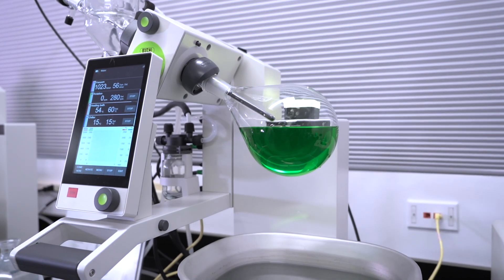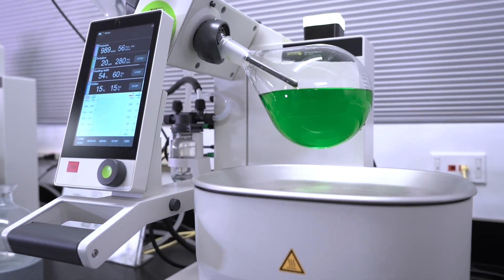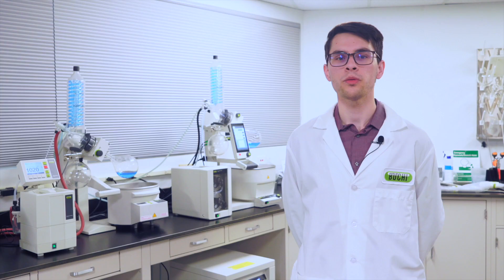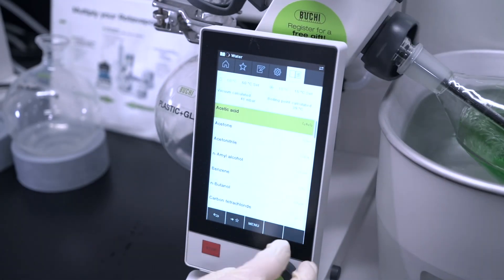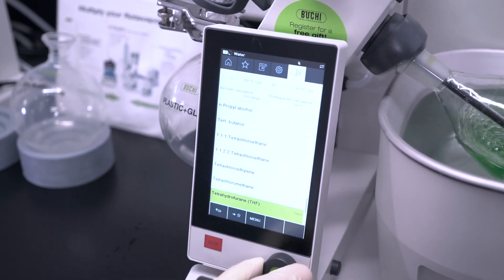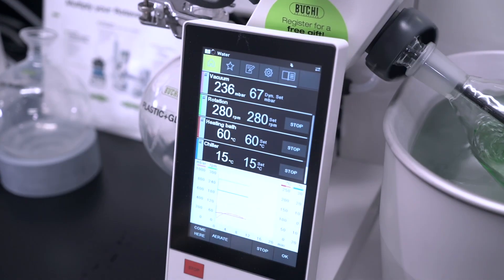The R300 pairs perfectly with the I300 or I300 Pro interface, bringing all process parameters to one central controller. When connected to an I300, simply pushing start once will heat up the bath, cool the chiller, pull vacuum, and rotate and lower the evaporating flask. The I300 Pro records run data to an SD card and even has the option to program methods for reproducible results when handling samples of similar composition, without manually adjusting parameters every distillation.